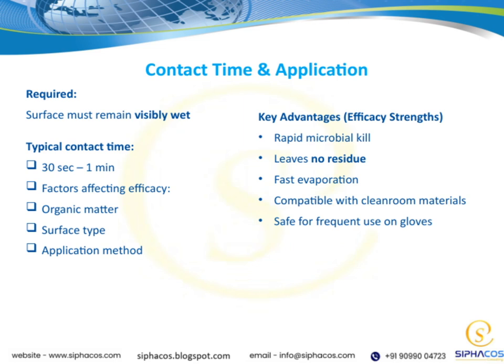Moving on to application specifics, the contact time is straightforward. The surface needs to stay visibly wet to ensure effective disinfection. Typically, you're looking at a contact time of about 30 seconds to 1 minute. However, it's important to remember that efficacy can be affected by a few factors. Organic matter like dirt or bodily fluids can reduce effectiveness, so surfaces should be as clean as possible beforehand.